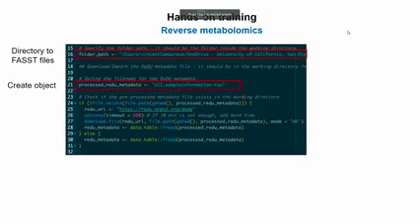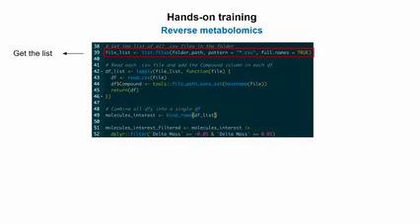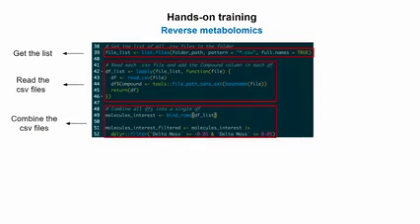So the paths that I'm mentioning are actually here. The first folder path is just the main folder. And then you can just put your files there, and the file list here, the first part of the code, would just automatically retrieve the CSV files that are in that specific folder. So that might be where there will be some issue. So please, if you don't see 3 files in your environment in RStudio, just raise your hand, and we'll come to you and fix the path.